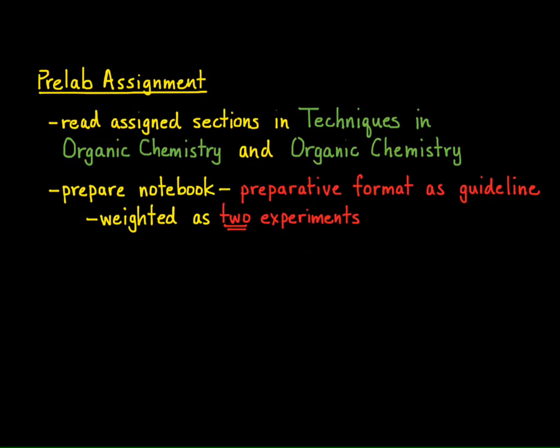Before coming to lab, make sure you read the assigned sections from Techniques in Organic Chemistry and your Organic Chemistry textbook. You should also set up your lab notebook. This week's experiment is a little different than others in that you will be developing a procedure using one given to you in the lab manual as a guideline. Keep in mind, this experiment will extend over 2 weeks and count as 2 experiments.